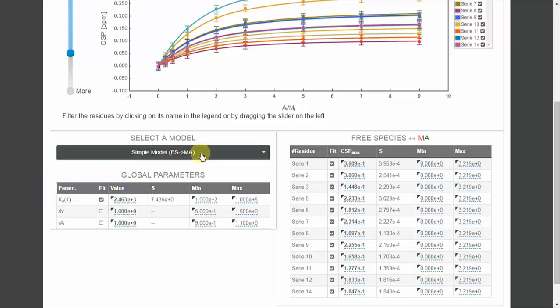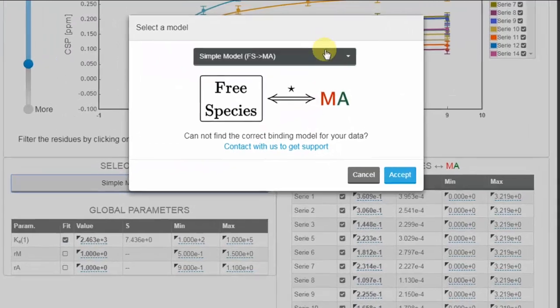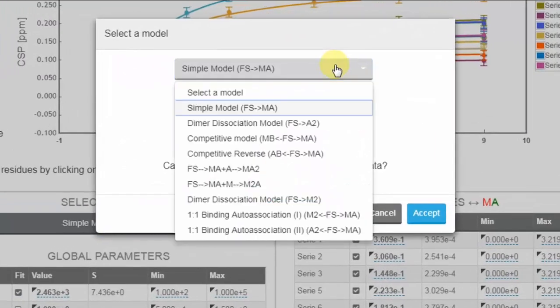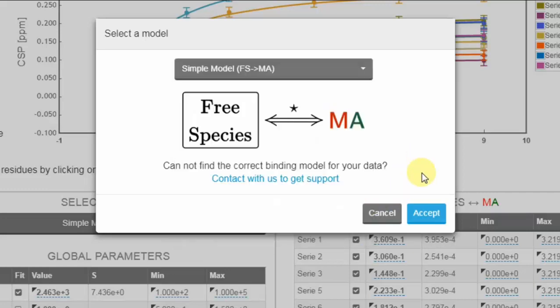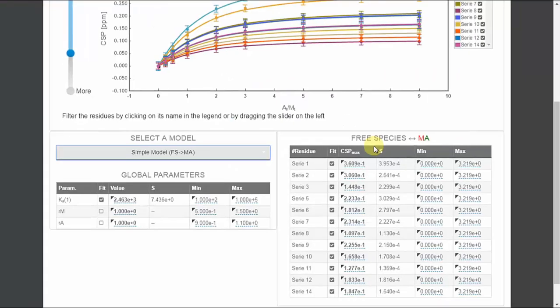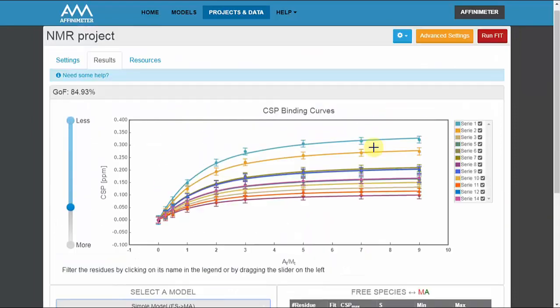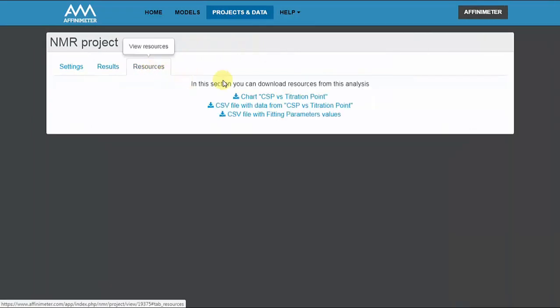Moreover affinimeter provides advanced binding models that can be used to analyse complex interactions. For instance, competitive model or one-to-one binding auto association. Finally, the information obtained after the analysis can be easily downloaded from resources.